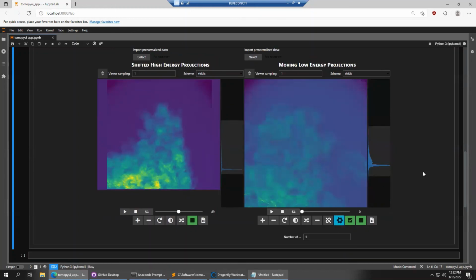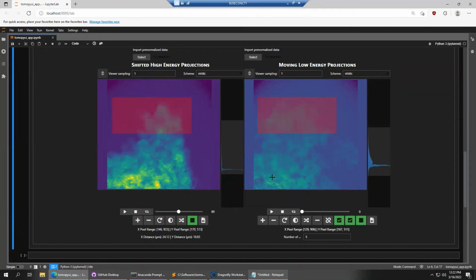So I want to load this in again and do this process again. I want to use only a small fraction of it, just like we did previously. The reason it screwed up was because of this big blob here, I think, that's coming in and out of the data set. So if I just click and drag on this, okay, these are changing simultaneously because we have to use an identical region to compare to in either of these images.